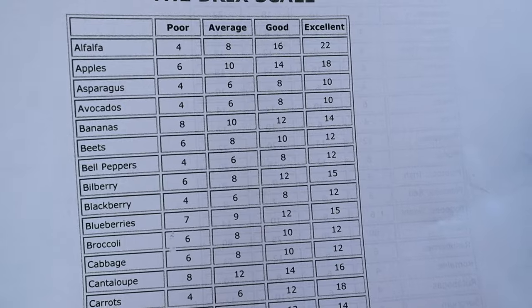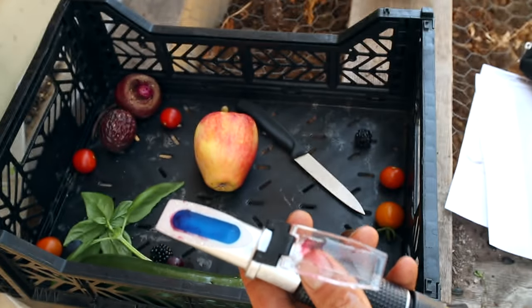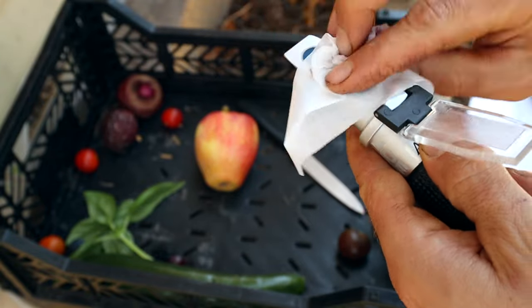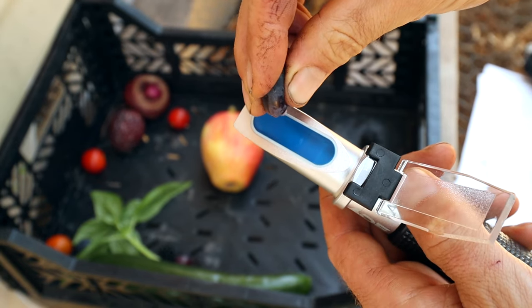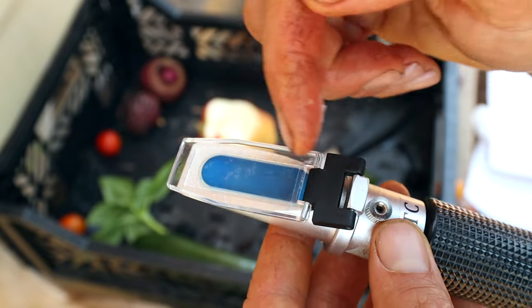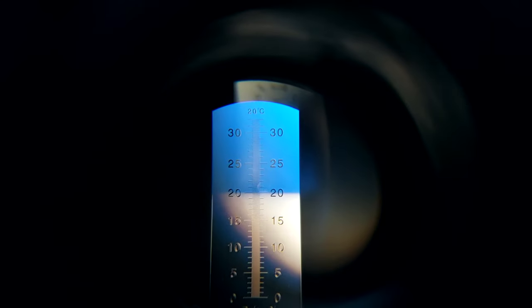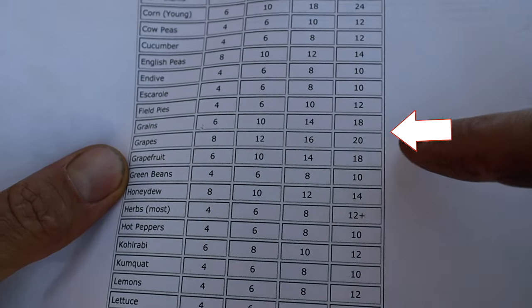In between each test I'm just going to spray it off, wipe it clean and dry, and we'll do the next one. Let's do the small Concord grape. When I'm putting the juice in I want to make sure there are basically no air bubbles and the juice is covering the whole slide. For the grapes I got 20 — awesome! This is so exciting.